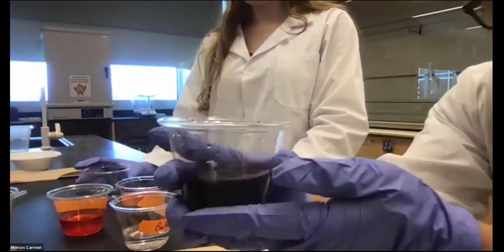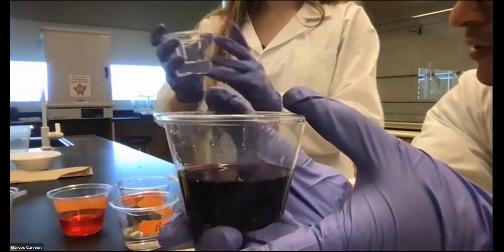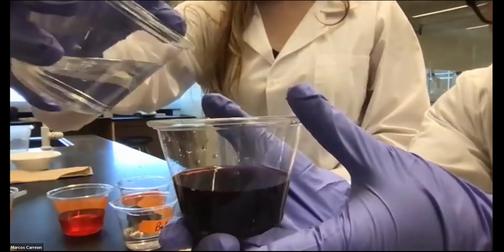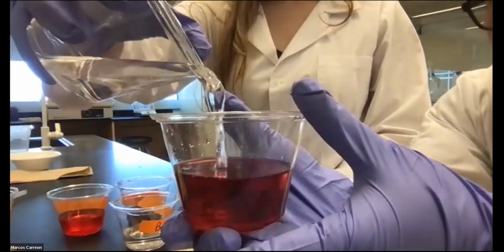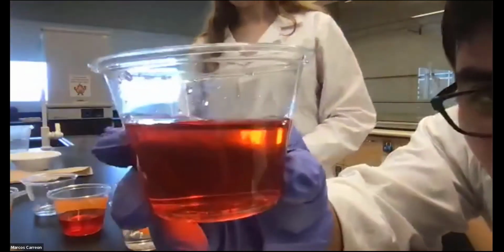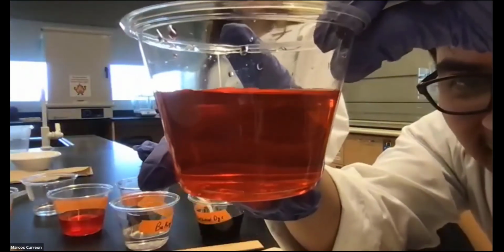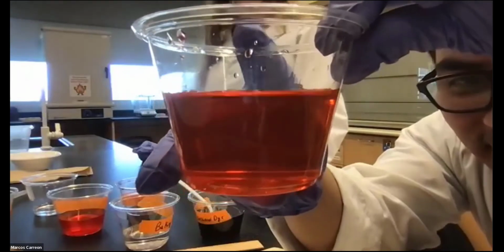All right, so this is our cochineal dye solution, and again, we're gonna demonstrate the vinegar on there. What may have caused the colors to change? She's adding the vinegar. Were you guys expecting those changes? Look at that color change. Wow. Yes, we love science. Chemistry is cool.